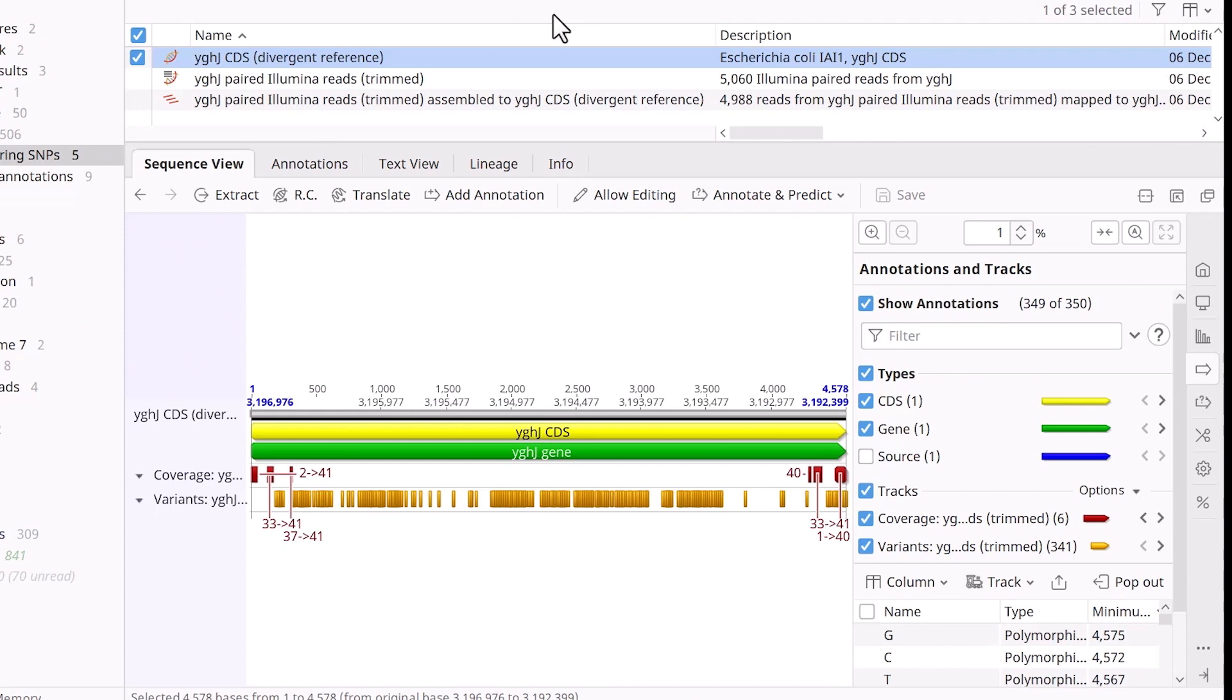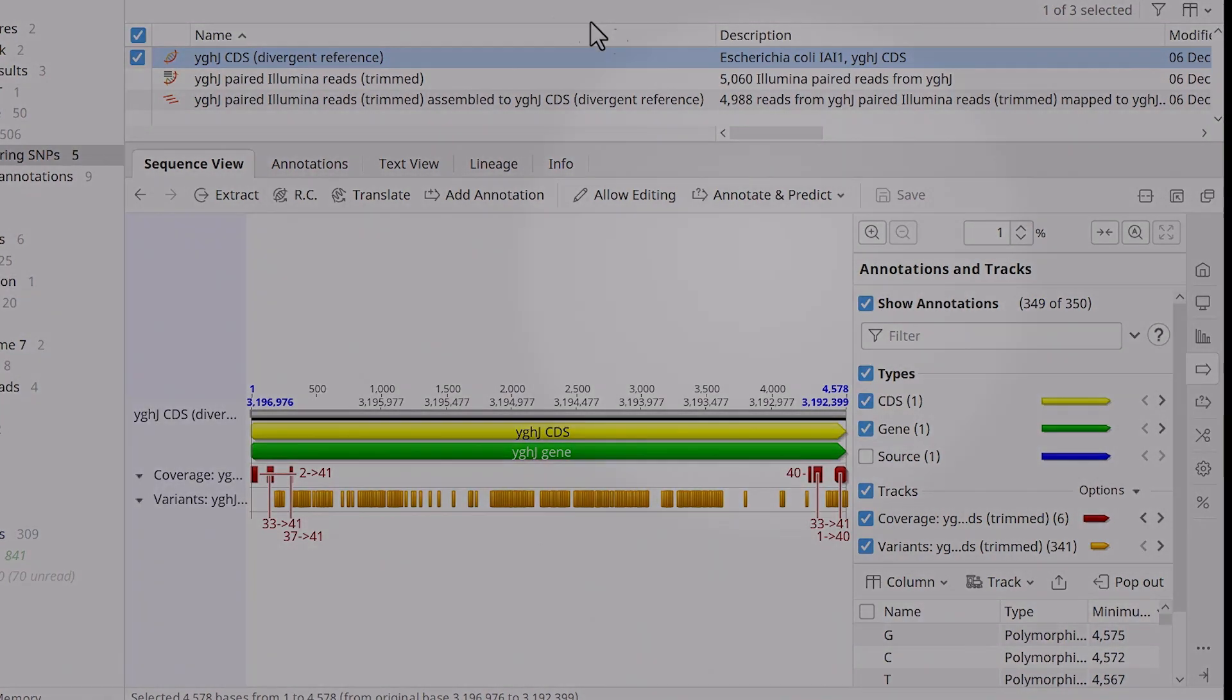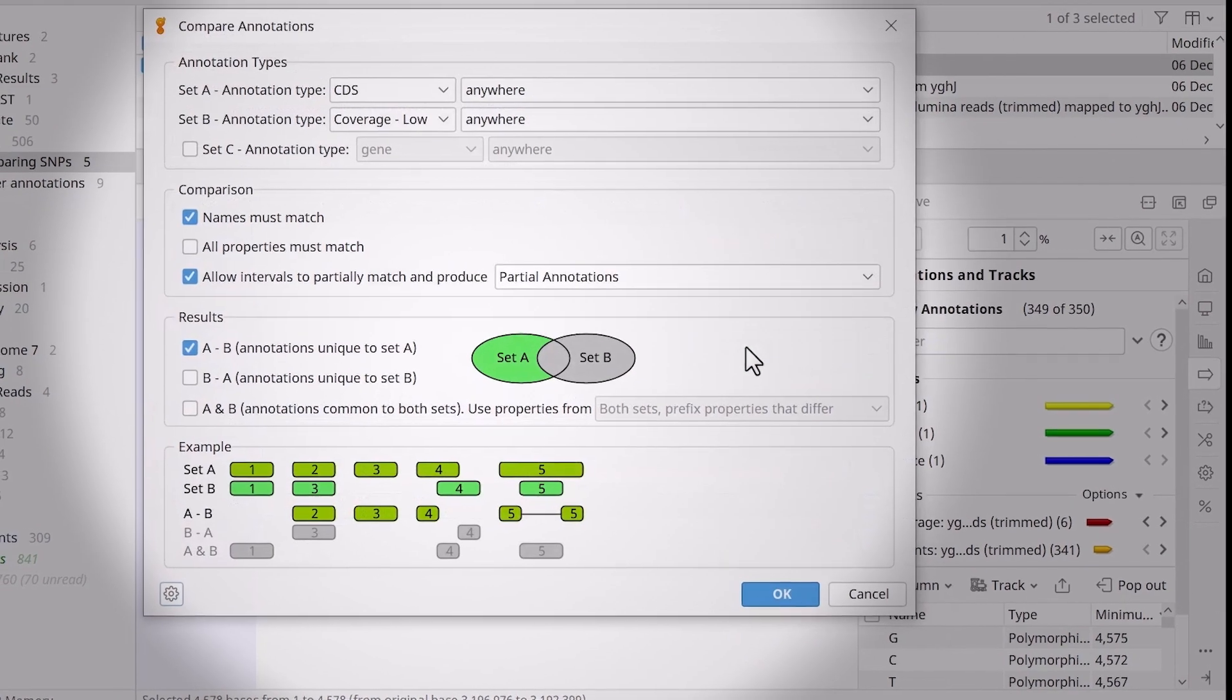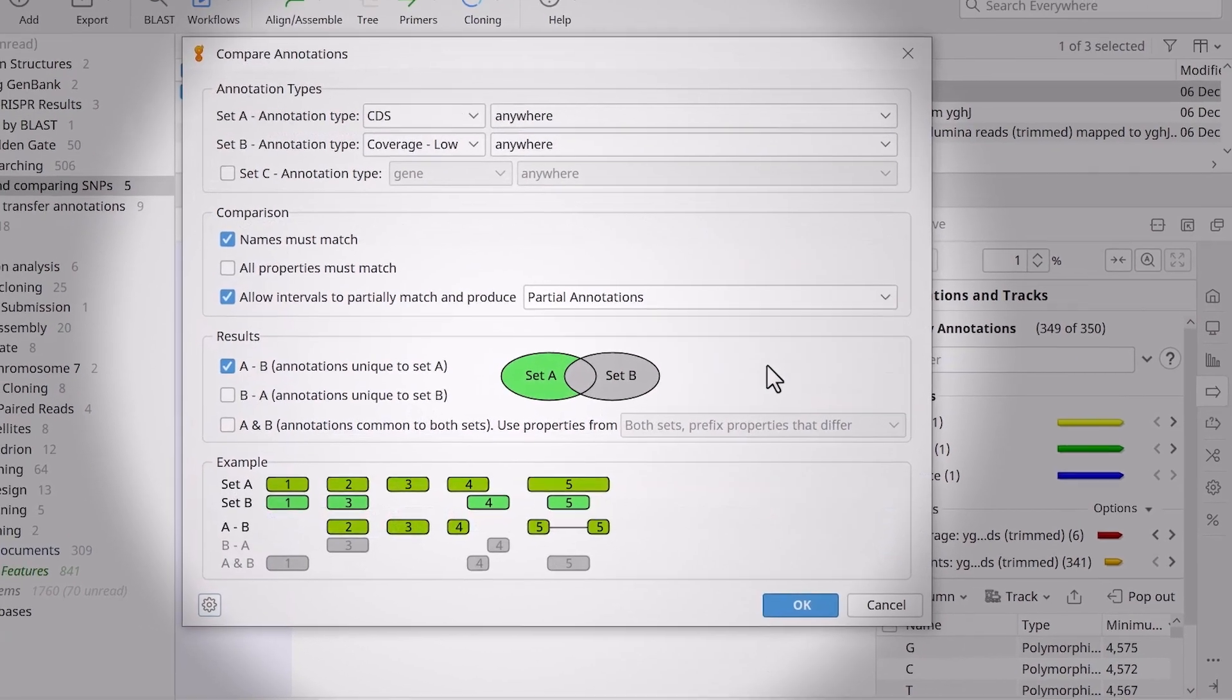By comparing SNP annotations, we can exclude SNPs from the variance track that also fall within the low coverage track. To do this, go to Annotate and Predict and select Compare Annotations.